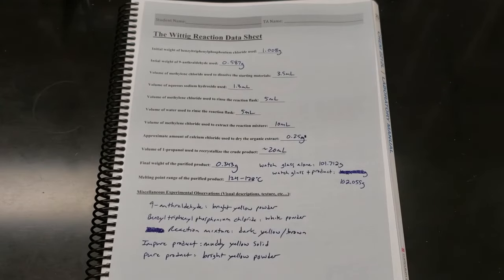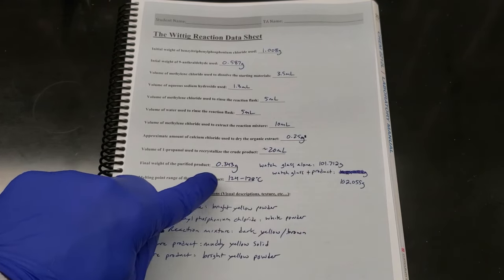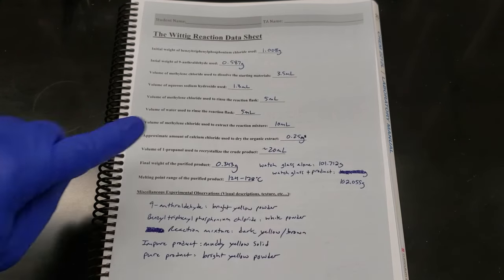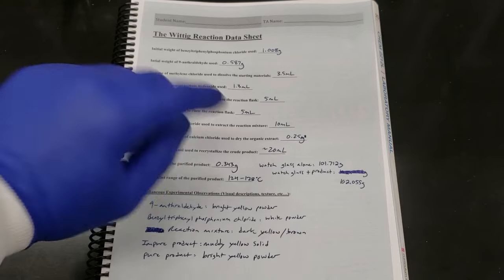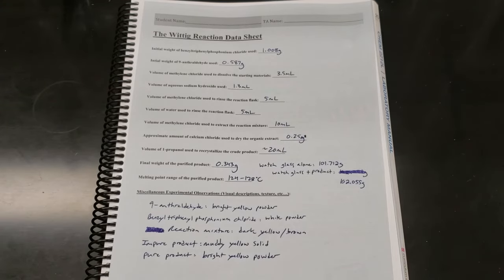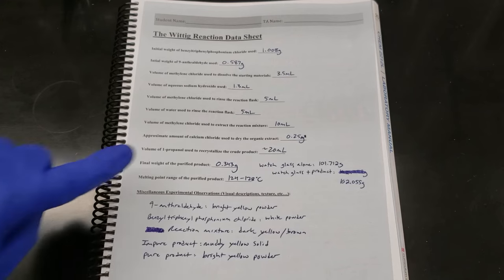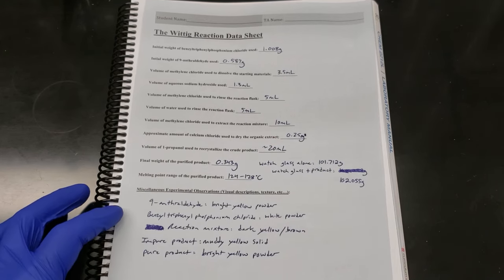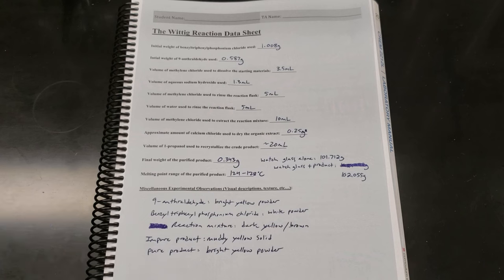Here's our final data sheet for this reaction. We completed our melting point test and we got a value of 124, a range of 124 to 128 degrees Celsius. We went back and weighed our watch glass. Once we cleaned it off, it came out to 101.712 grams. That gives us a difference of 0.343 grams for our purified product, so 343 milligrams. All of my observations are recorded down at the bottom, so this is the data that you'll use to write up your report to calculate your limiting reagents, your theoretical yields, and your final yield. Good luck.